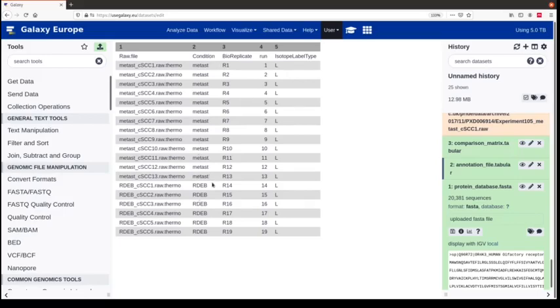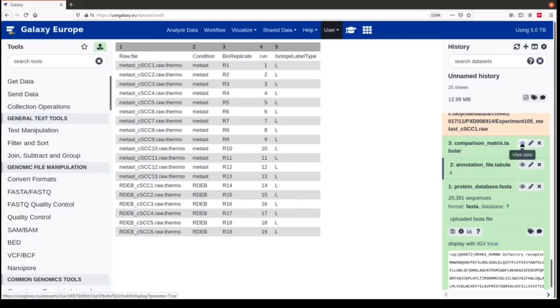The conditions column specifies a binary comparison — we have only two groups. Replicates indicates that from each patient we have one sample processed. So we have 19 files and 19 different patients, and because it's label-free, the 19 samples were measured in 19 different runs. When we want to perform MSStats after MaxQuant analysis, it's important that we also add an isotope label type column to the annotation file, which in all cases is only 'L' (light), because we don't have any heavy spike-in peptides.